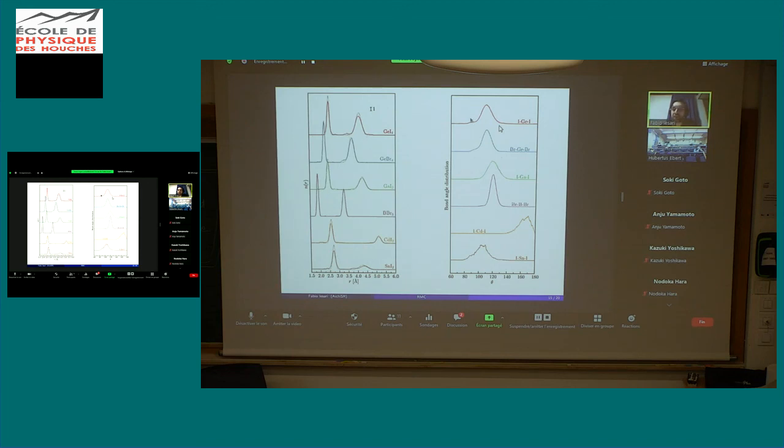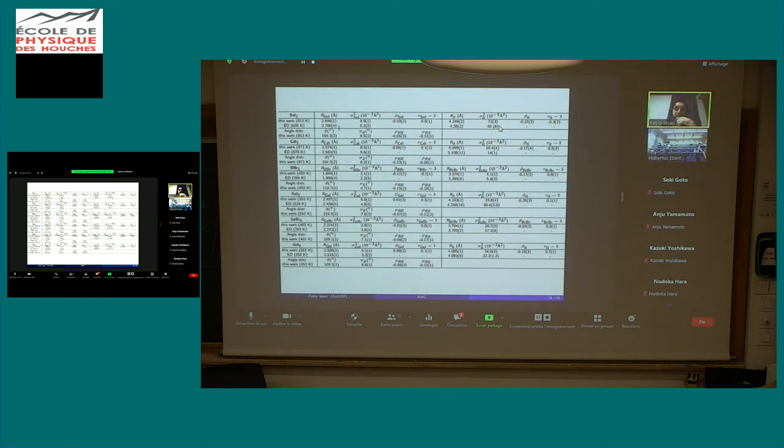But the important point is that if we look at the bond angle distribution for the central atom for all the molecules, in all cases we could obtain the correct angle for the various molecules. And additionally, by calculating the average over different numbers of steps of the RMC simulation, we could calculate the average distance and the Debye-Waller factor, but also the correlations between the angles and the distances.